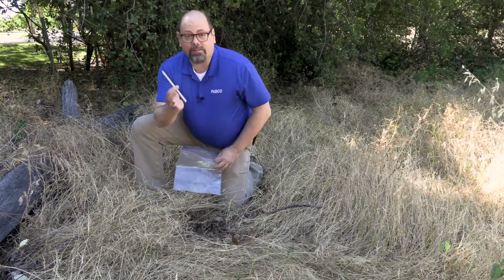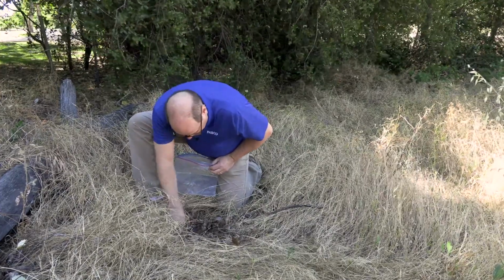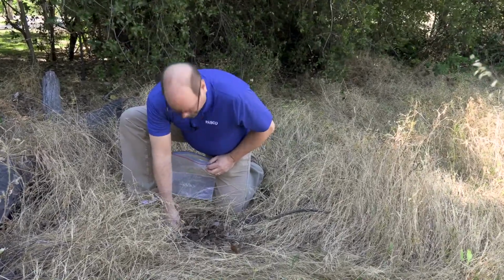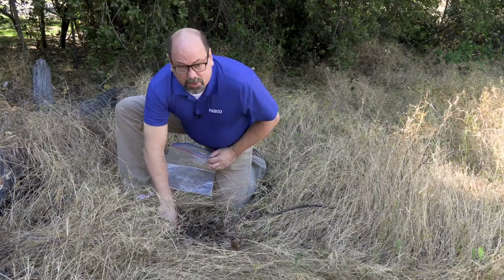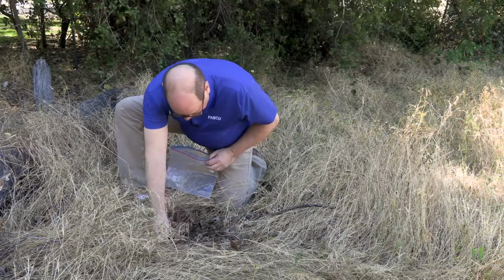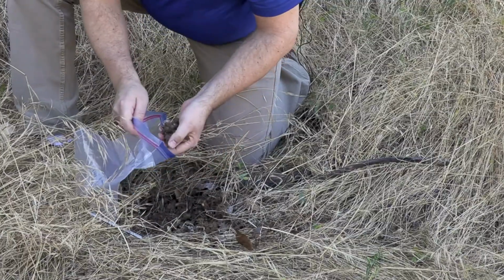We're going to just take any kind of a device that you can dig with, a trowel, or if you got a little shovel. We're going to loosen it up first. Get down into this. You can see it's kind of a grayish black, nice, lots of organic material. We're going to take 3 other samples besides this one, which are already back in the lab, and we'll compare those. All right, so I've got a nice set of material. We're going to add that to our bag.